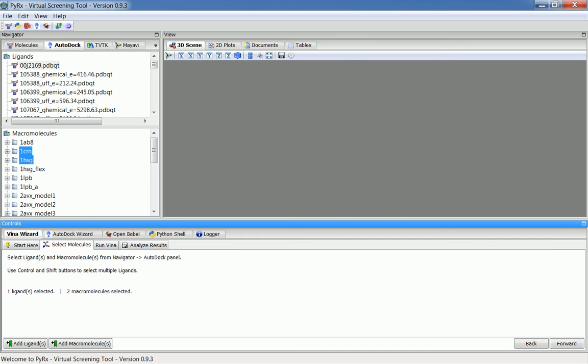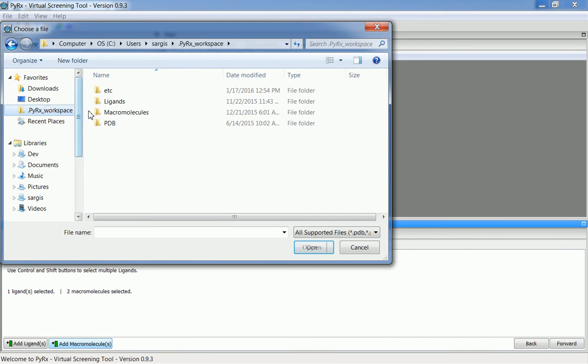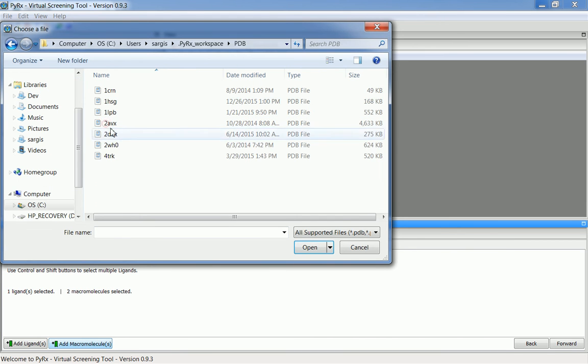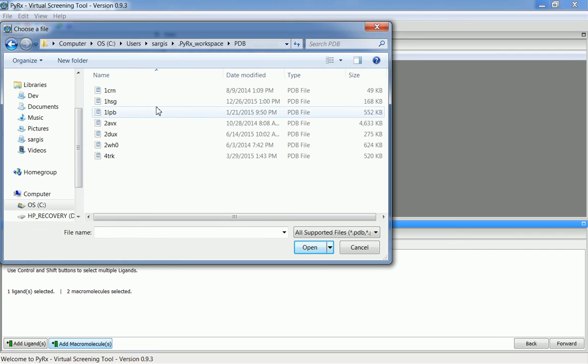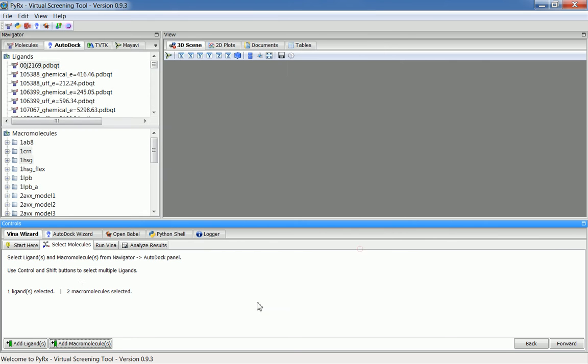New in this release is also an option to add multiple macromolecules at once. The way you do it, you will go to a folder that contains your PDB files, and instead of selecting one PDB, you will have an option to select multiple PDB files. This will convert them to macromolecule PDBQT that you can use for inverse virtual screening.